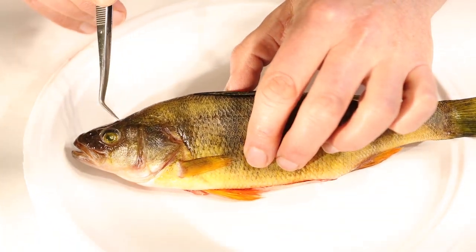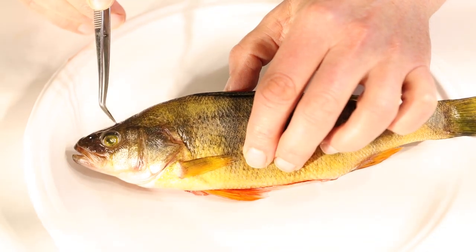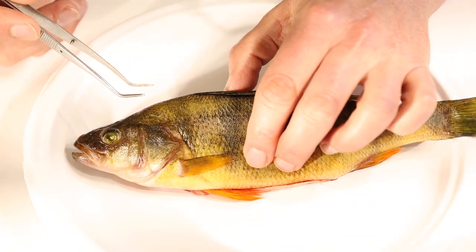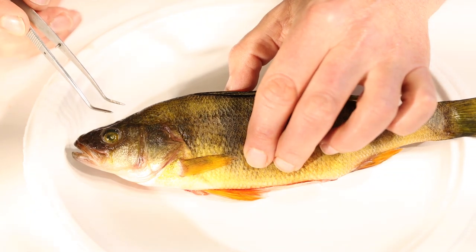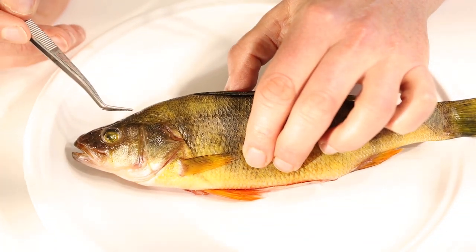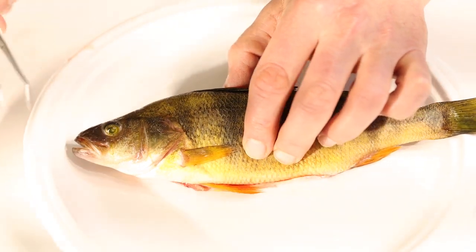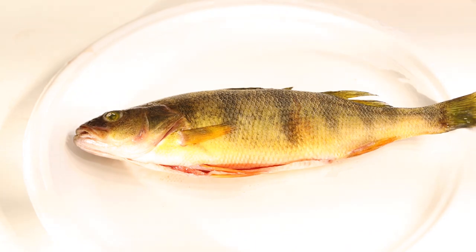If we find the eye, the brain is right up here in the top of its head, back behind the eye. The problem is we have to get the skull apart — it's a hard bone — but we have to be really careful. If we hit that brain with our tweezers or scissors, it's going to turn to mush and there's going to be nothing for us to see. So very carefully, we're going to make a couple of cuts.